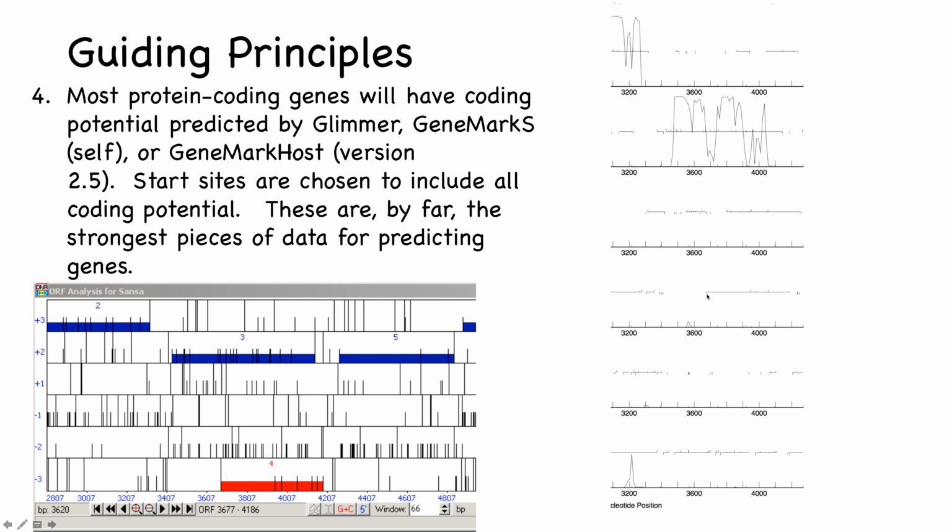If you look down here in this first frame of the reverse genes, you can see here's the stop for GP4, and here's a number of different starts. The first thing you're going to notice is there's virtually no coding potential here. So if I had to choose between these 2 genes, clearly I would choose GP3 as being real, and GP4 is probably not a gene because it doesn't have coding potential. Oh, and here they're indicating where those genes are.